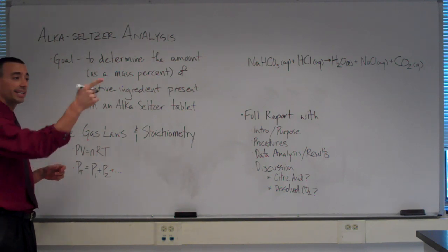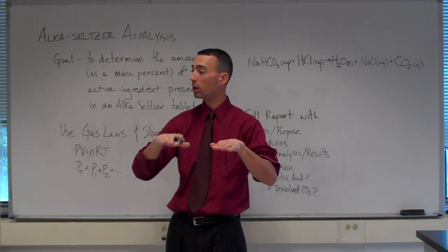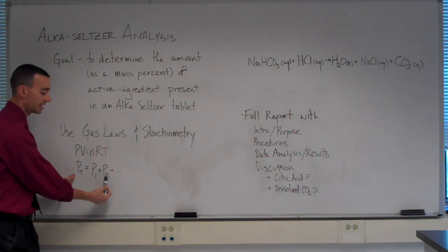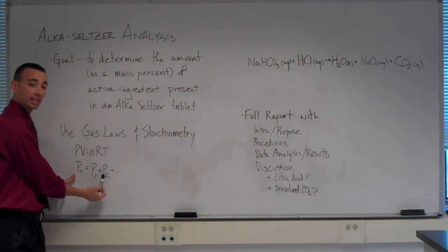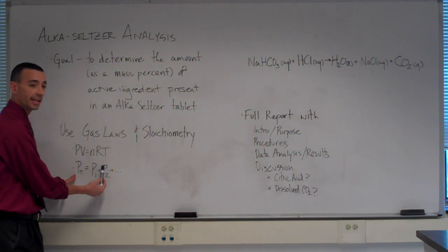So the pressure inside my burette, which was equal to the pressure of the atmosphere, so I'll read that from the barometer in the laboratory, that will be my total pressure. That comes from 2 gases, carbon dioxide and water vapor. Water vapor's value is a constant that I can look up online. There is a great resource available from the General Chemistry Laboratory site. You can find a link to a very accurate listing of water vapor pressure values at different temperatures.